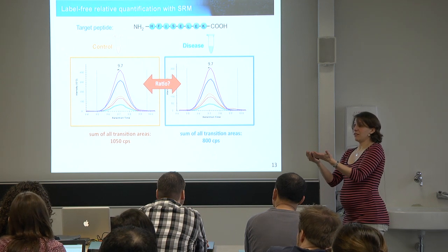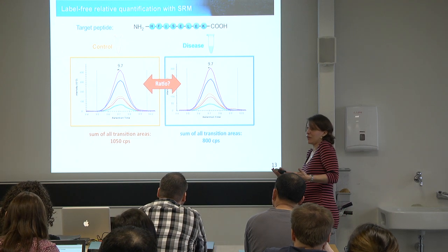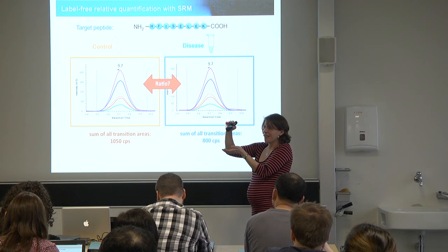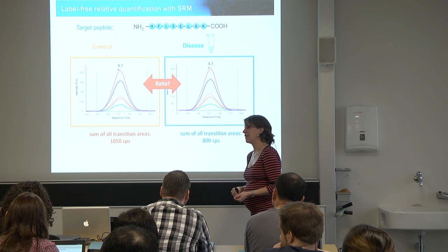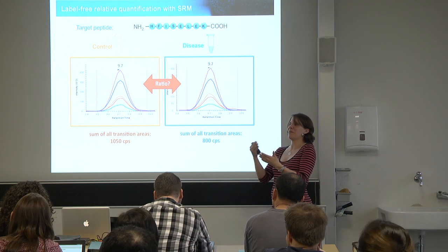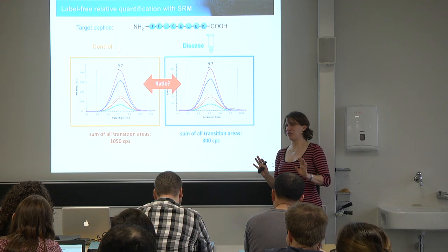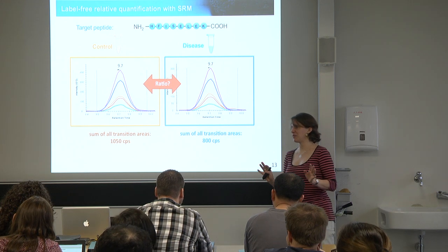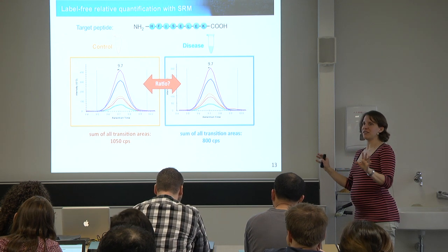This is a weighted output, because on the final sum, a high intense one will have contributed more than a low intensity one. So it just comes from the nature of summing that you put more weight on some than on others. But I think there's no specific scientific expression for it. And when you work with Skyline, it will do this anyway for you.